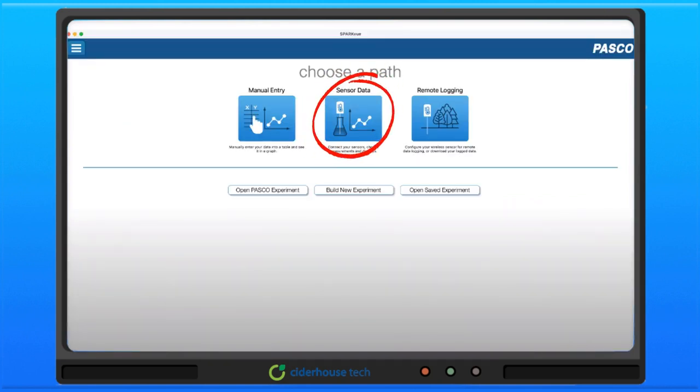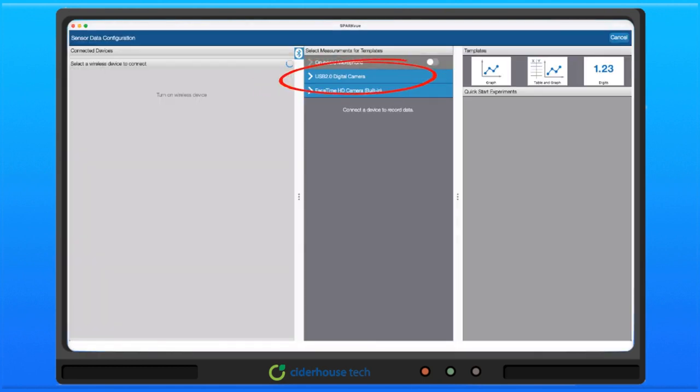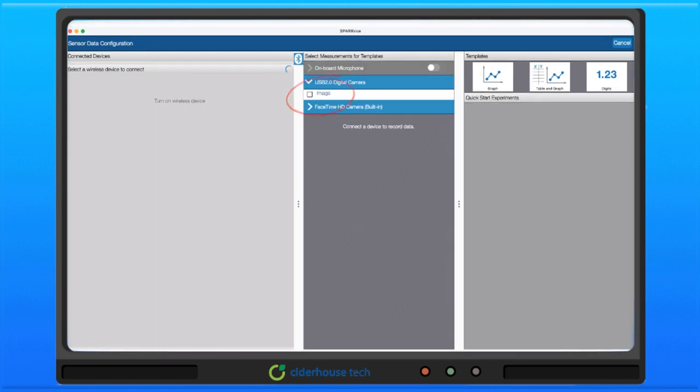To access the digital microscope, we must first select the sensor data button. As the digital microscope is already plugged in, it appears in the middle column. Its name will vary by which brand of digital microscope you are using. Click on your device's name. Now select the image checkbox.